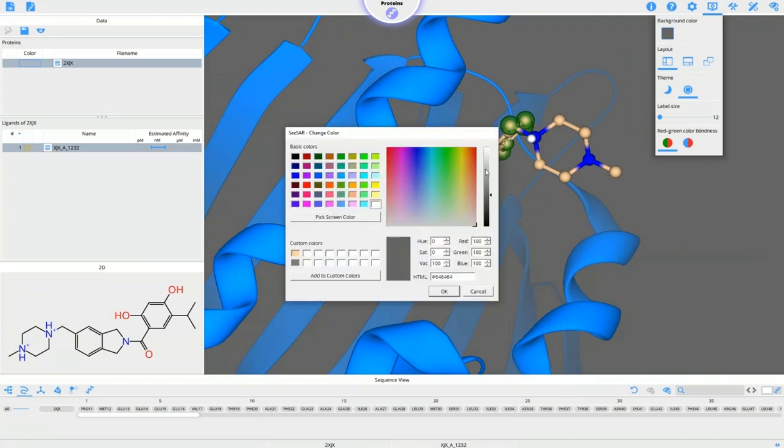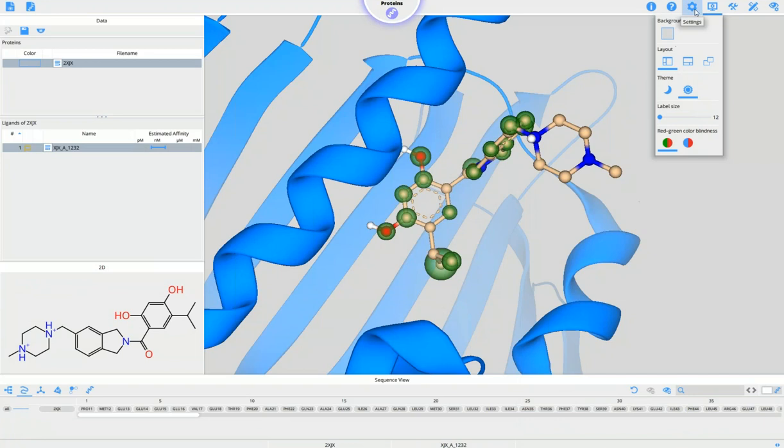Equally, the background color, I will make it a little bit lighter for this presentation, hoping that this gives you a better view on what I'm doing here. Okay. All the buttons here on the top right are independent from the mode I am in. On the top left will appear buttons that are just precisely for the modes we are working in.